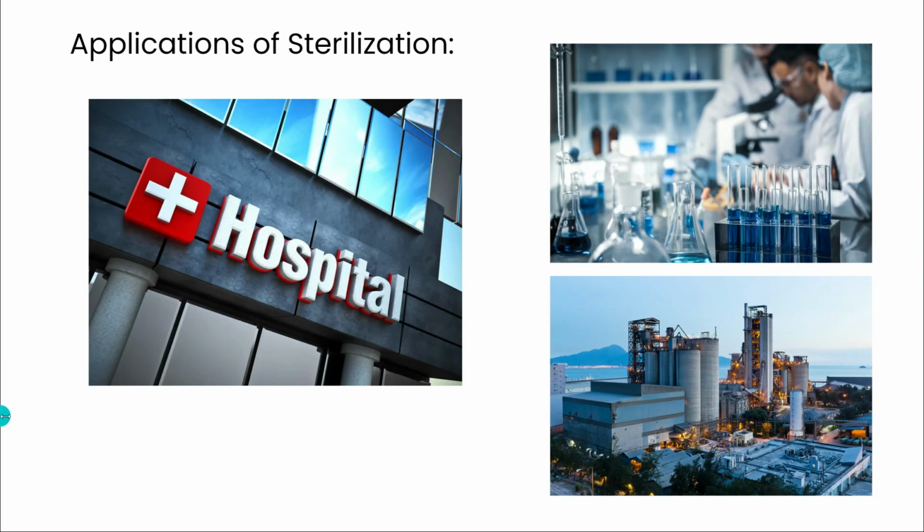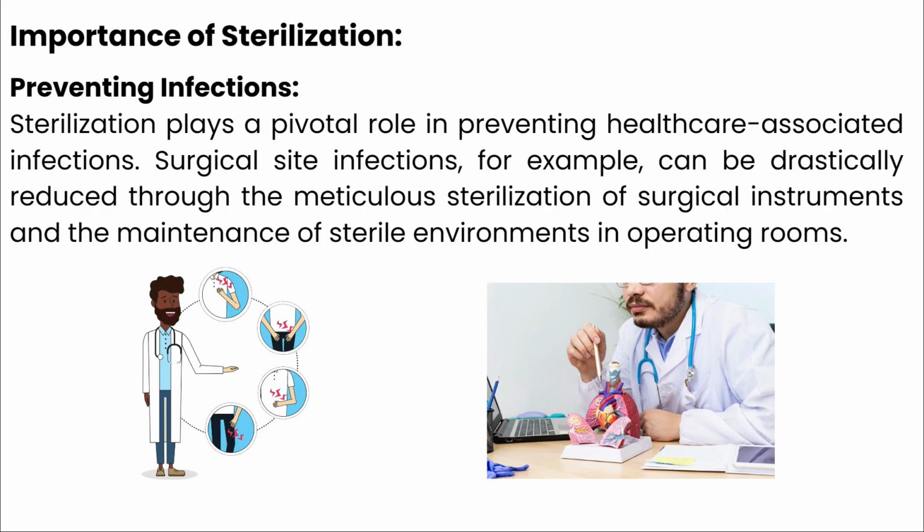Moving on to the applications of sterilization, the sterilization process is carried out in hospitals, big research laboratories, industries, etc. Every industry, it might be the food industry, pharmaceutical industry, drug industry, etc. Everywhere sterilization is one of the most fundamental laboratory practices. The importance of sterilization, the basic thumb rule, is to prevent infection, to prevent contamination, and to reduce the microbial load from the given sample.